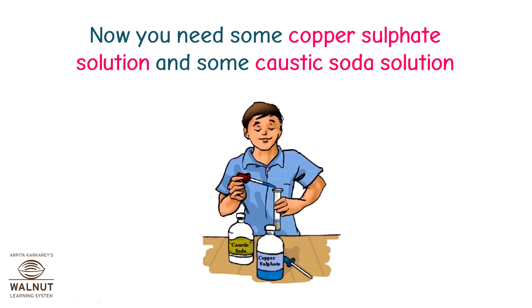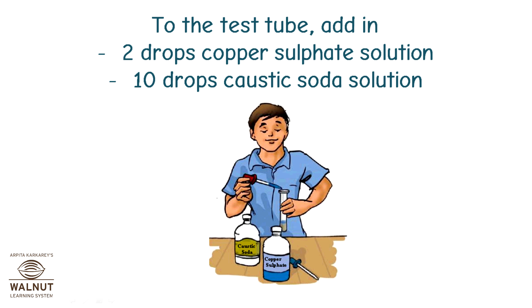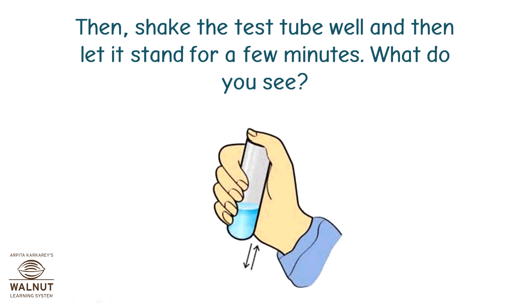Shake the test tube. Now, you need some copper sulfate solution and some caustic soda solution. To the test tube, add 2 drops of copper sulfate solution and 10 drops of caustic soda solution. Then shake the test tube well and let it stand for a few minutes.